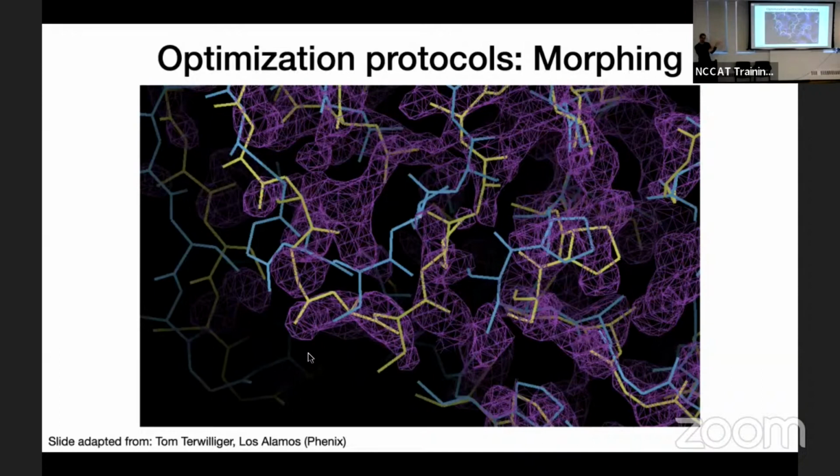There I think it's sensible to say, okay, I know it's not overlapping with this other atom, so I'm going to put it in some place that makes geometric sense. Now, in a case where the map is really clearly showing you that the side chain should be over here, but it's going to end up clashing with something if you put it there, then I think it can often point you to something else that's wrong with the model, right? So it could mean that the adjacent part of the protein is mismodeled in some way. It's fairly common that there'll be a sort of domino series of changes you have to make. So you need to change the neighboring residue in order to make space for that sidechain movement that the map is telling you to make. So it is a little case by case, but yeah.